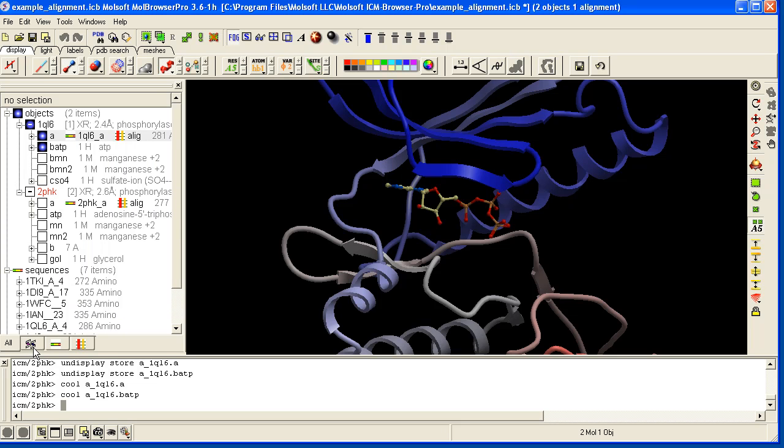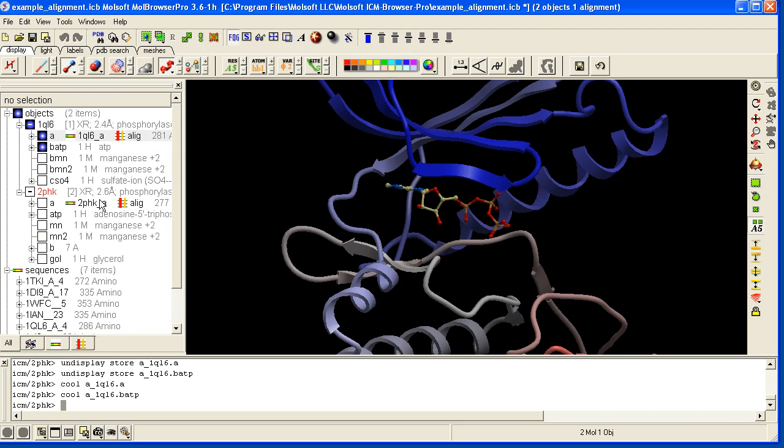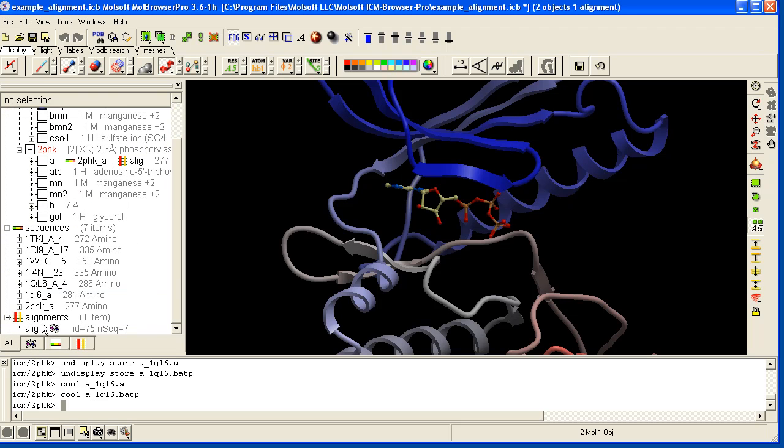The workspace is also divided by object types. So here by default you see all of the objects. We have objects, we have sequences and we have alignments.